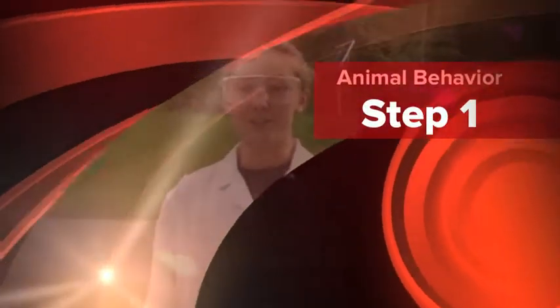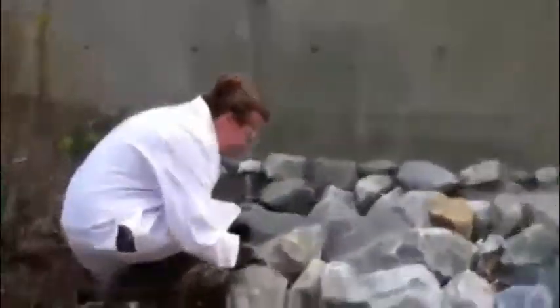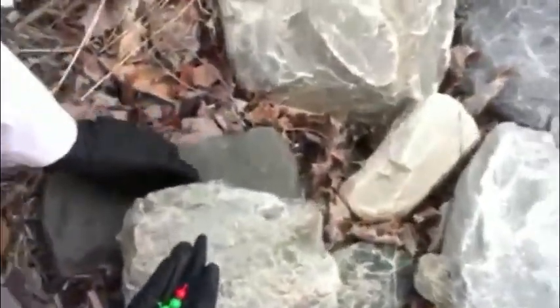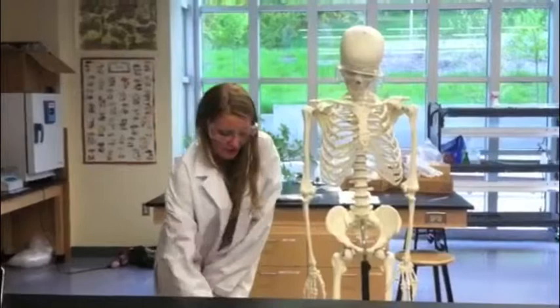First, you need to collect the organisms you will be testing on. You can use organisms such as ants, which you can find outside, or your teacher can supply you with organisms such as termites.